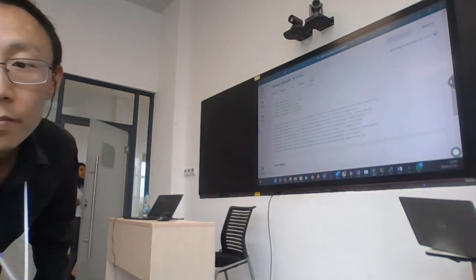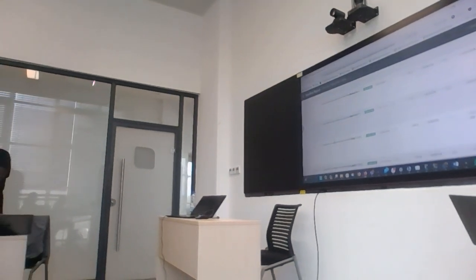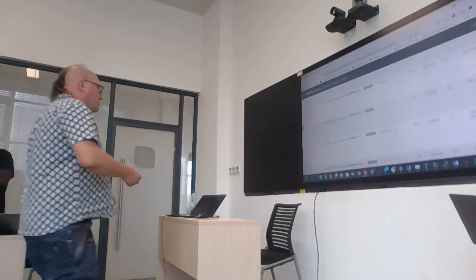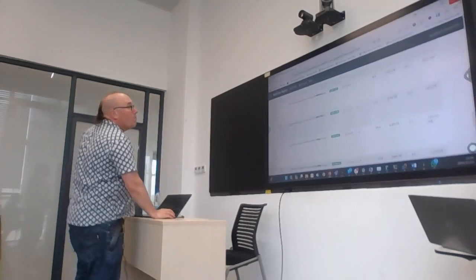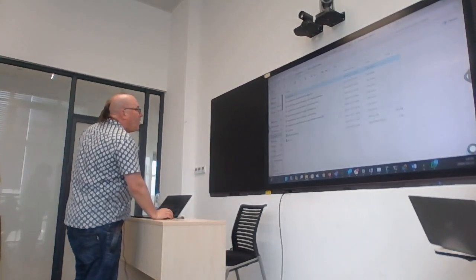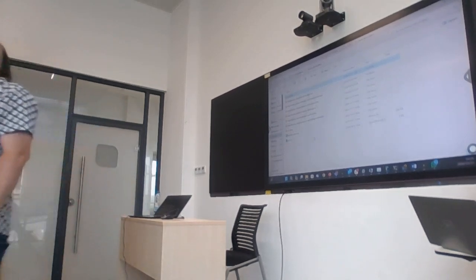But can we make new use of it? Directory are useful to help people debug the problem. Okay? Then each step has its different output files. Okay?